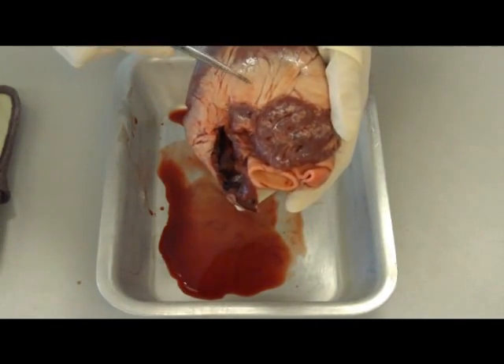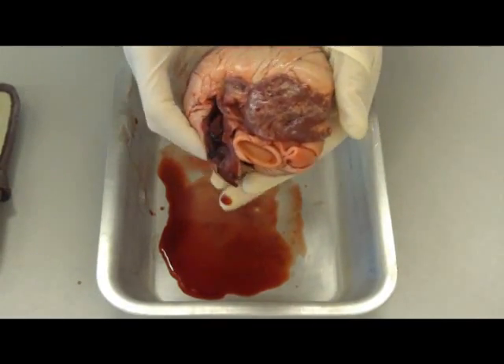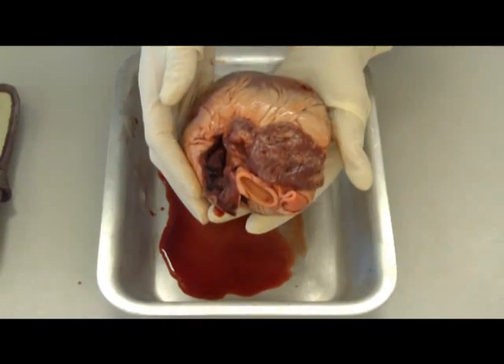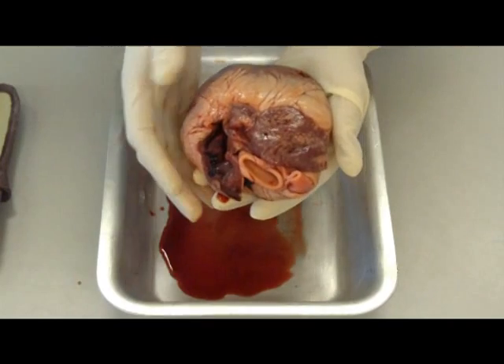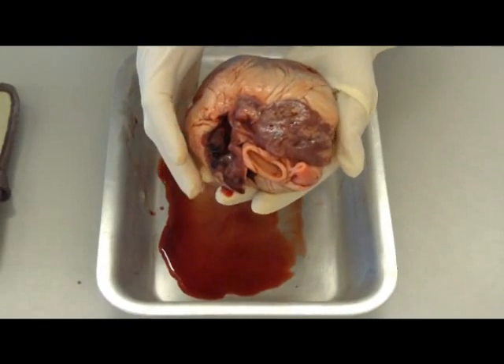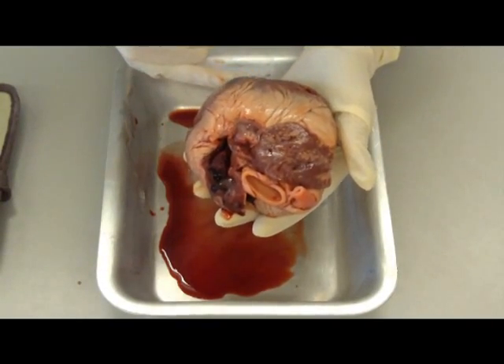You can see a little bit coming off there, but basically that's covered around the heart to actually protect it. The heart is split into the left and the right side. The left side is more muscular because it pumps the blood to the whole body, whereas the right side actually only pumps it to the lungs. At the bottom of the heart, you've got the apex.